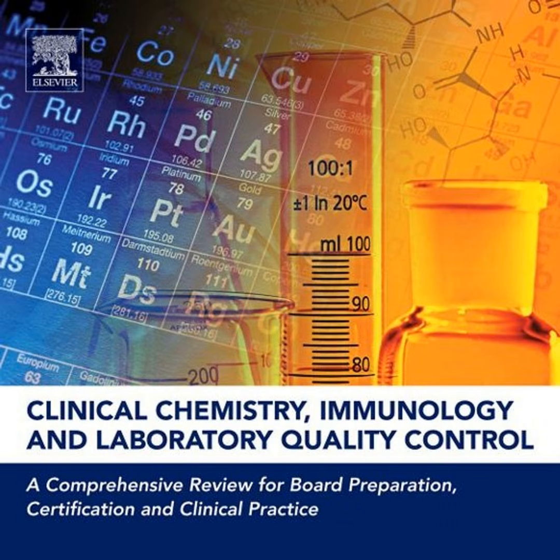Spectrophotometry. It's the most common method of analysis. You're essentially just quantifying something by measuring how much light it absorbs. Or sometimes how much it transmits, right? Exactly. And that all relies directly on Beer's law. Beer's law, that beautiful linear relationship. It is the concentration of the substance and the light it absorbs. If the concentration doubles, the absorbance doubles. That's simple as. But of course, the clinical lab needs a lot more than just colorimetry.